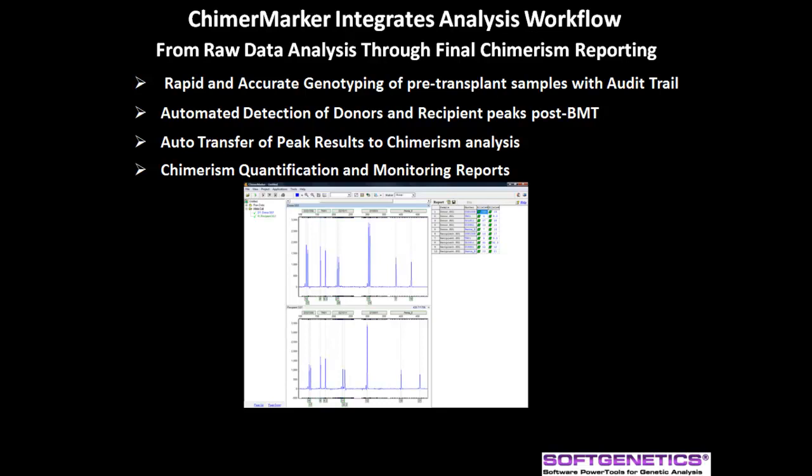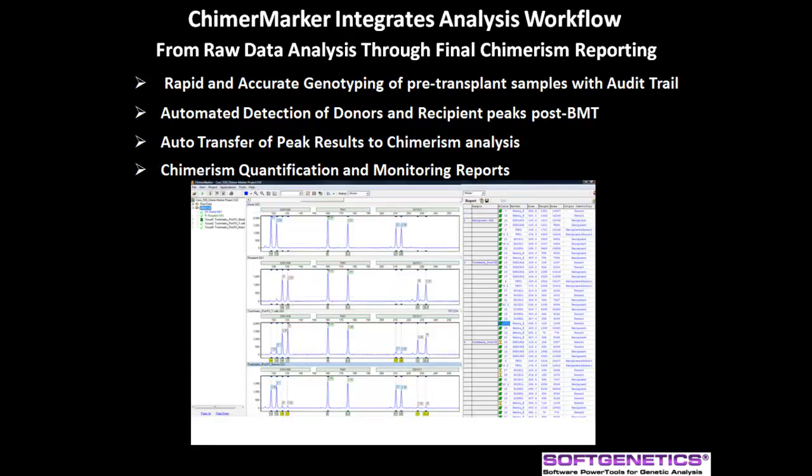The second step is to apply a case-specific chimertyping panel for automated detection of donors and recipient peaks post-BMT. Donor, recipient, and shared peaks are labeled in the electropherogram and the allele report table. Quantification options include using peak height or area.